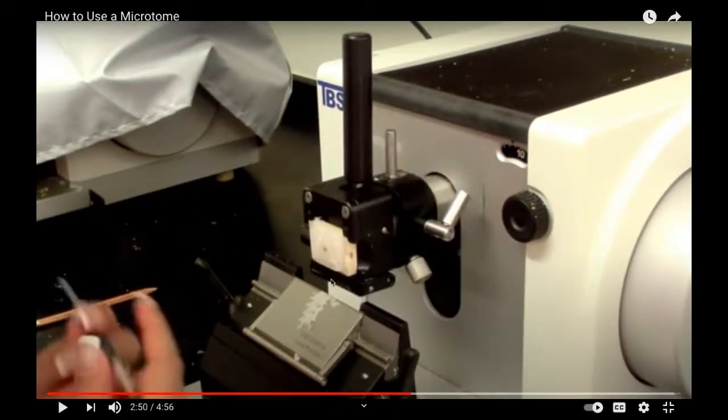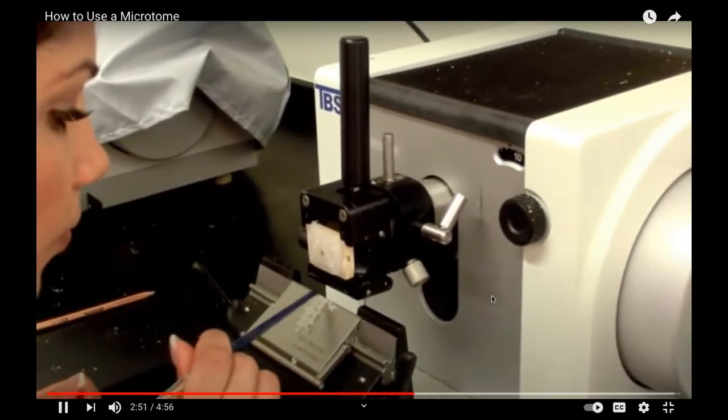So here you can see this is our sample. This small dot you are seeing is from the mouse, one kidney or any tissue that you want to see under the microscope, and this has been embedded into the paraffin wax in this plastic box. And then there is a blade here, and this is a machine which moves up and down, and this blade is making these thin sections of 10 microns, and these sections will be put over the slide and we will fix them with the help of histology experiments. Multiple sections of your tissue.